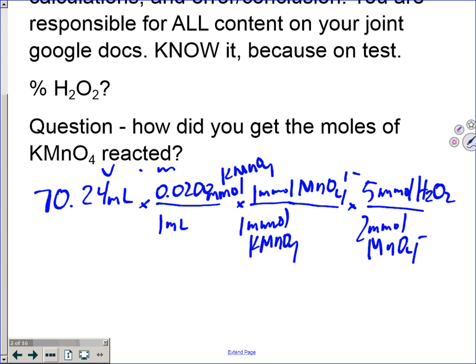So as we go through the determining of the true moles of potassium permanganate when we multiply by the molarity, and then we go to use the mole ratio, we're finding the true moles or millimoles of hydrogen peroxide that react. This is how many moles of hydrogen peroxide that reacted with that amount of potassium permanganate at the equivalence point, which we found to be at the point when what happened? Change to pinkish, right? Okay.